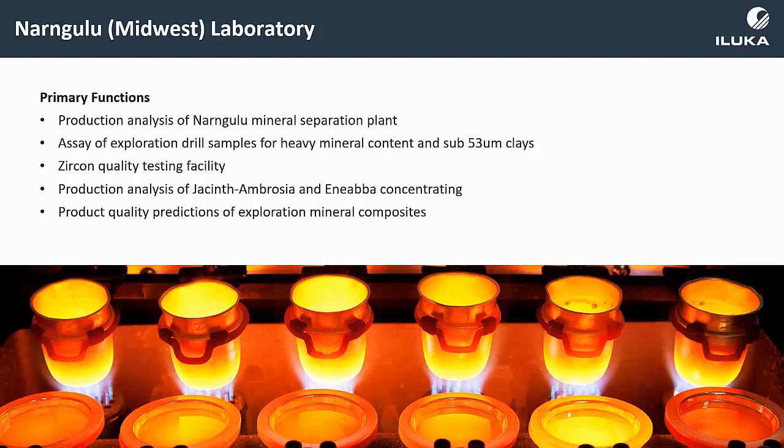The Midwest laboratory is slightly different. So we support the Narngulu mineral separations plant. Primarily, we perform all of our exploration drill testing for slimes and heavy mineral content. So that is primarily just within Australia. We have our zircon testing facility.